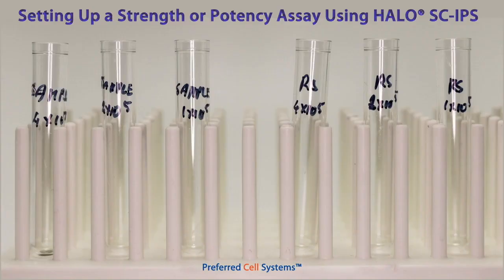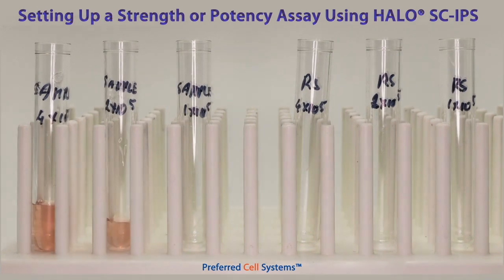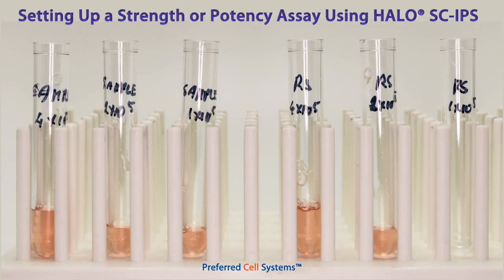A cell suspension of the tissue is prepared and the mononuclear cell count determined. As previously described, the cell concentration is adjusted and a 3-point cell dilution prepared for the sample tissue. For a mononuclear cell or MNC preparation, this is 400,000, 200,000 and 100,000 cells per milliliter. You will only need between 0.3 and 0.4 milliliters of the highest cell concentration.